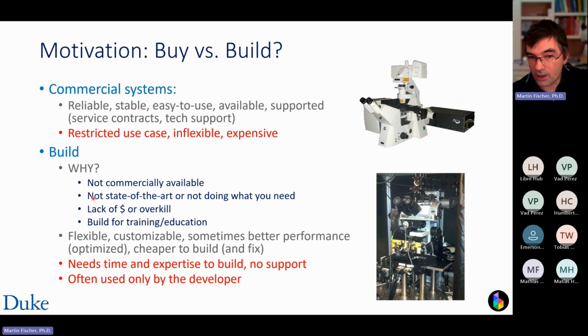Maybe they're not state of the art. A microscope technique has been developed, but it's not commercial yet. It takes some time for a company to produce an off-the-shelf part. Or it's not doing exactly what you need, so you have no choice. You have to build it yourself.